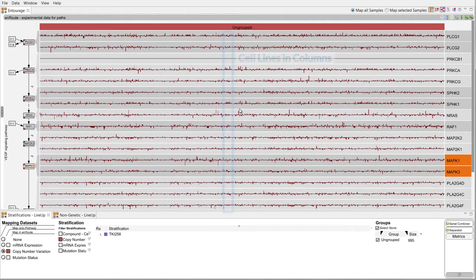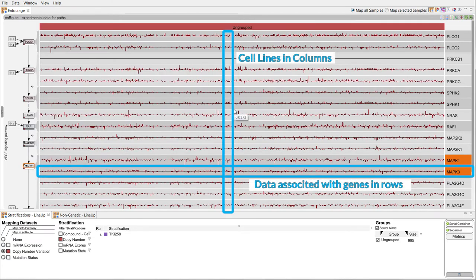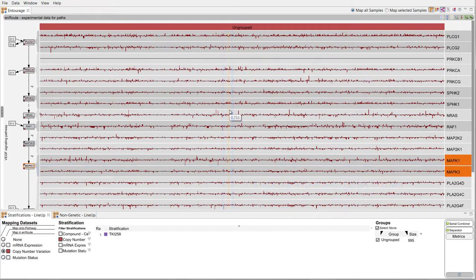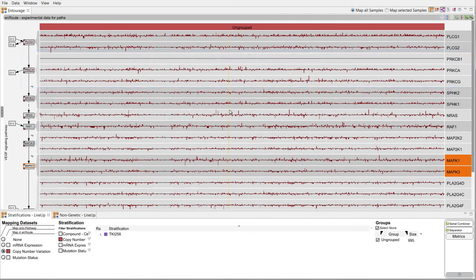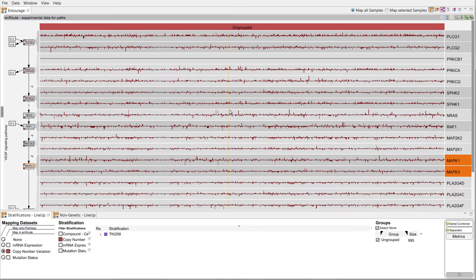Each column represents a cell line, each row shows the values associated with a gene. A single pathway node can represent multiple genes, which is indicated by multiple rows that connect to a node. The data shown here is copy number variation, which is shown as bar charts.